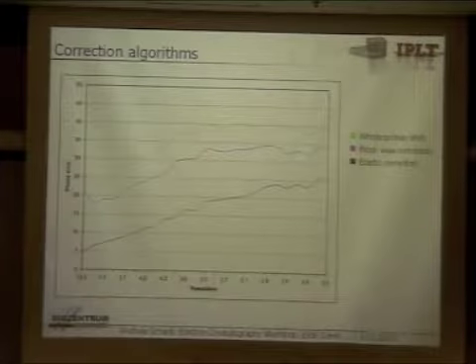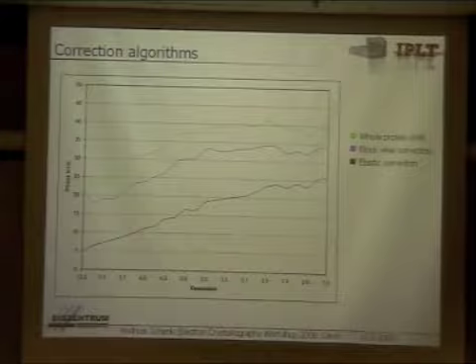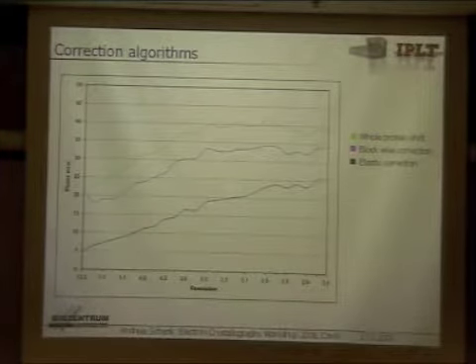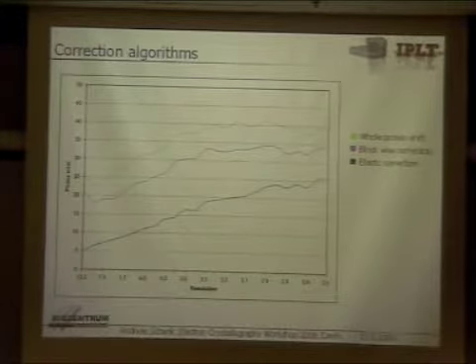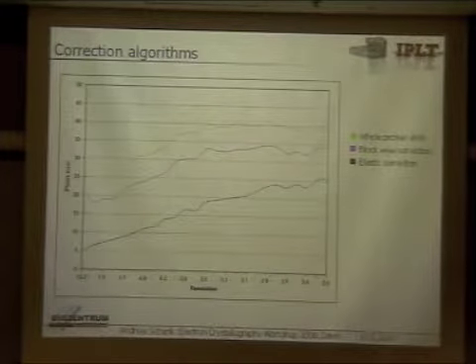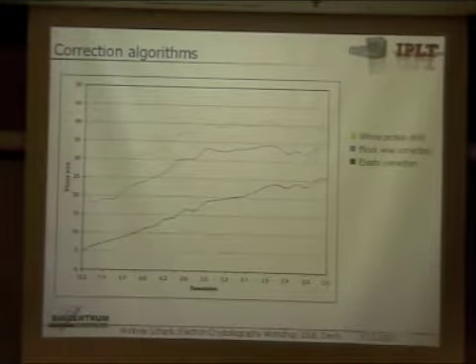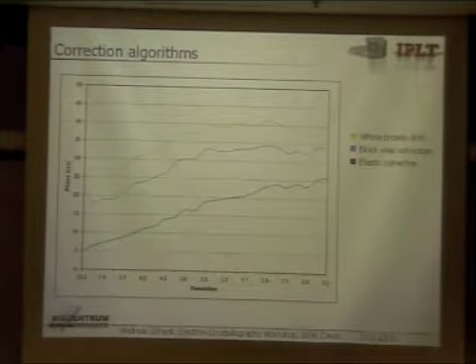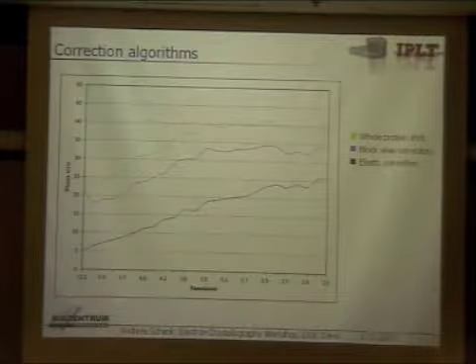That's now one of the next steps we want to take: really apply the different algorithms on experimental images. You basically need a full processed project, and then do an average over several images and see if you get better resolution. That's in a way the only criterion you can judge which algorithm is better by. You cannot directly compare on one image, because you never know which of the phases you get out is the correct one. But that's definitely the thing we want to try.